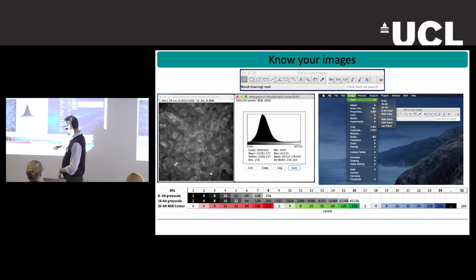Okay. Do they have this image? Is there one image that we shared? No, but I have everything here. Later on, I will play a little bit with ImageJ. Or if you want, while explaining, I can do it, but as you wish. No, sorry.